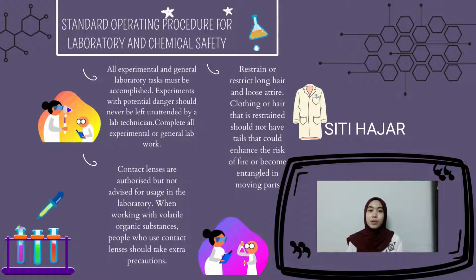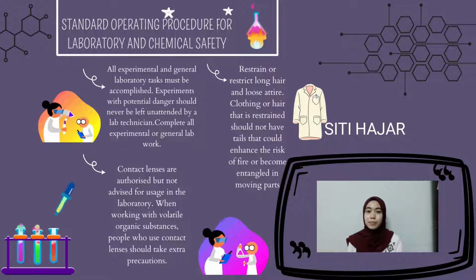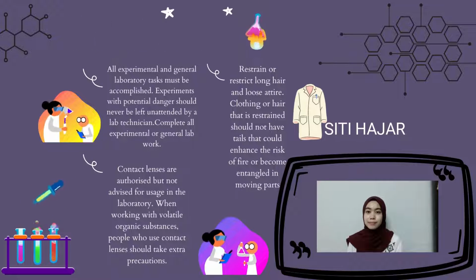Number 5, while contact lenses are authorized, they are not suggested for usage in the lab. Contact lens wearers face difficulty while working.